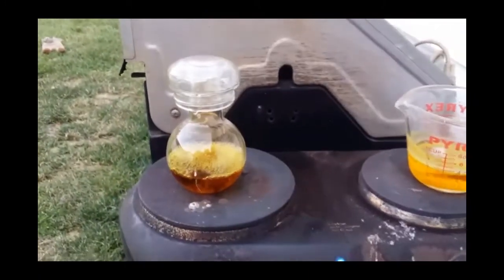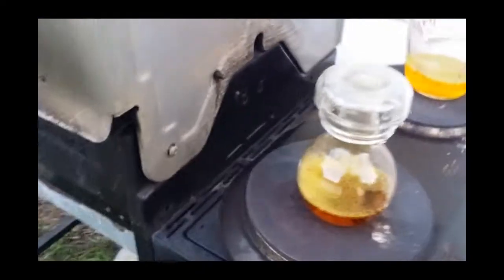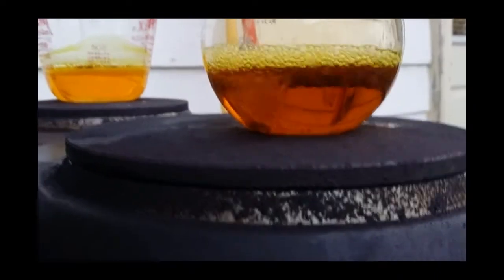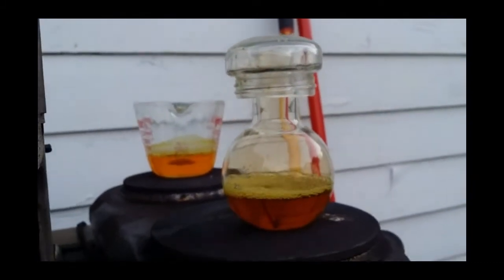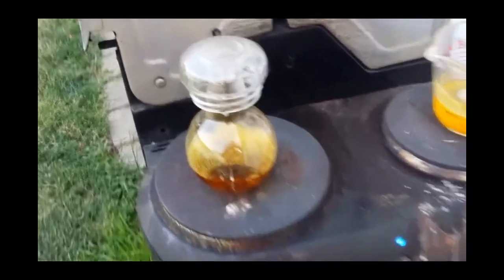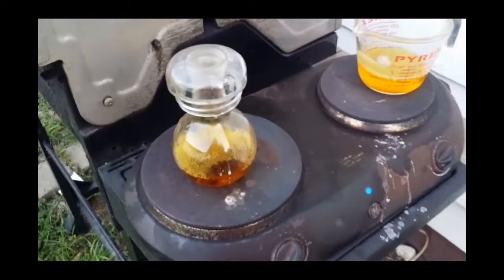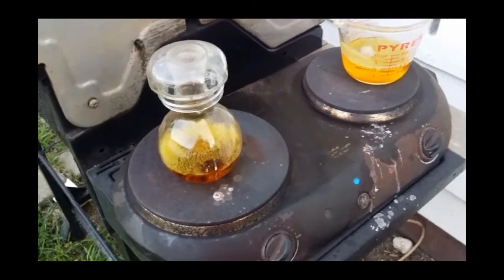This has been running probably close to 12 hours for one tooth. It's almost gone. That was something that dripped out of a little lid here, cover, watch glass, whatever you want to call it. That's not quite what it is, but you can see it's distilling over some of the probably peroxide, mostly water. It doesn't have a smell when it burns off, but then again, I also don't stand around it.